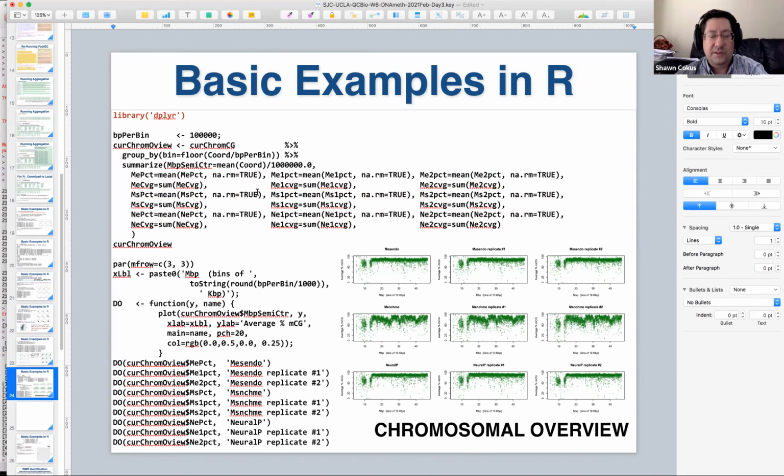Anyway, great. We're almost done. It's just that to plot this thing, we don't really want to make plots with the x-axis being bin numbers, right? It's not too crazy because our bin size in decimal is a power of 10, and so it's easily convertible to whatever units you want. If you want megabases, it's add or delete some zeros or move the decimal point or something.